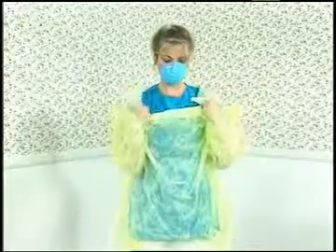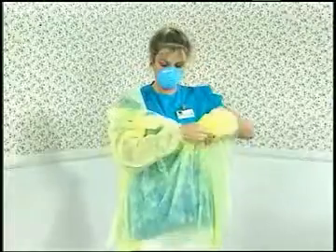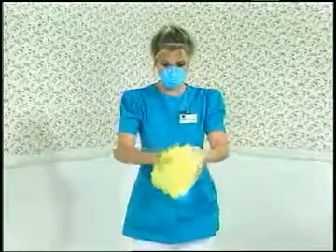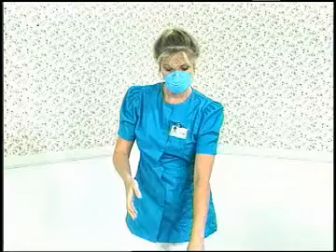Unfasten the waist and loosen the gown. Open the neck of the gown. The neck fasteners are considered clean. Remove the gown by rolling it away from yourself into a ball. Roll it with the contaminated portion inside. If the gown was used where special contact precautions have been ordered, it should be discarded inside the room.